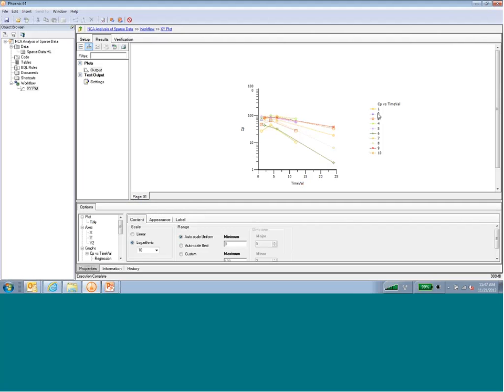So for example, subject 1, which is the yellow circle, we see that this animal only supplied 3 observations. And then animals are assigned to different sampling schemes where each animal only provides 3 observations, but there's a staggered sample collection interval such that now the overall mean profile would have 6 observations. We'll call this overlay individuals.